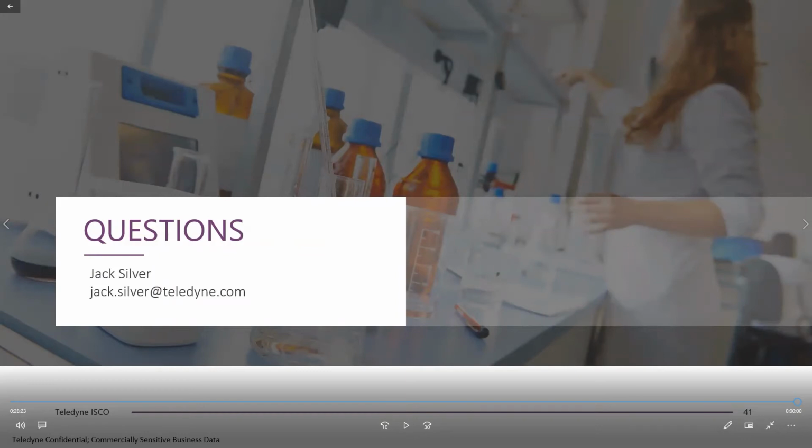What should be my solvent composition for loading? The solvent composition should be as weak a solvent as possible to allow the sample to be focused at the head of the column. A lot of people use DMSO, and if the compound elutes with more than 40 or 50% B solvent for reverse phase, that works very well. However, DMSO is a stronger eluting solvent than water, so if you have compounds that elute in mostly aqueous mobile phase, the compound will tend to elute a little earlier and you will get peak distortion.